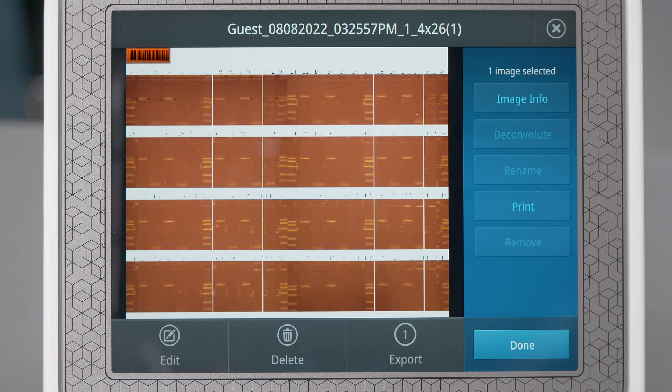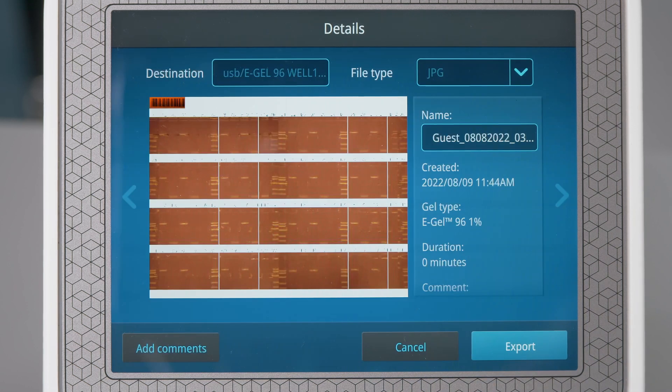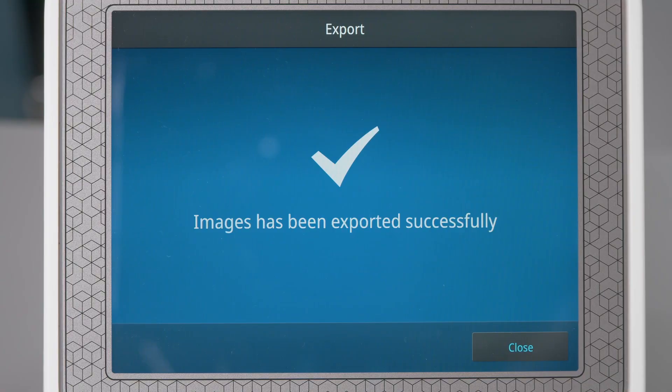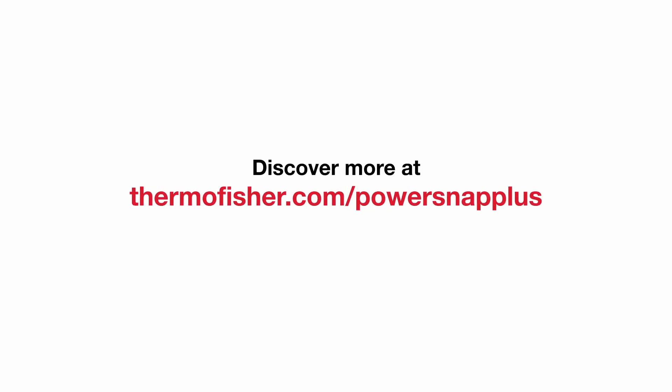The process is not destructive and when exporting, the new image is saved in the gallery in your preferred well arrangement. Discover more at ThermoFisher.com/PowerSnapPlus.